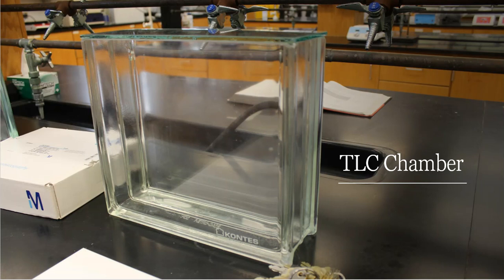So here is a real-life lab, and this is an appropriate TLC chamber. I pulled out three of these because the lab tells me to run one ethyl acetate, one hexane, and one 50-50 mix, and of course I can't put all of those into the same tank. So I brought out three of these chambers, and I'm getting ready to bring out three plates as well.